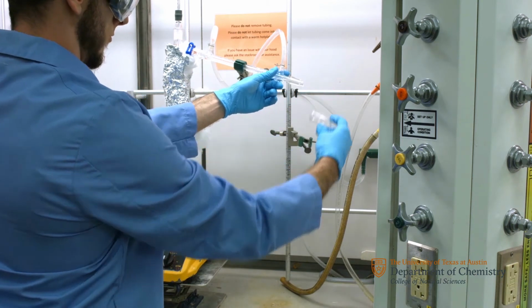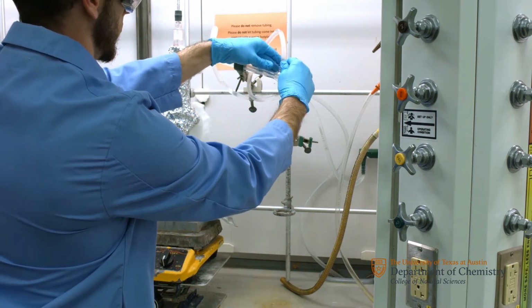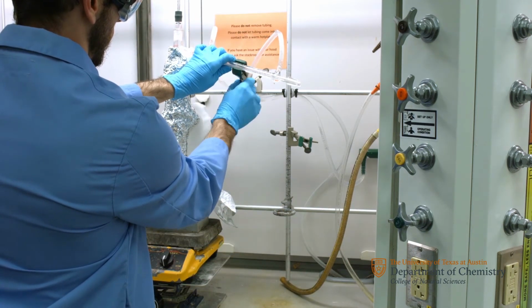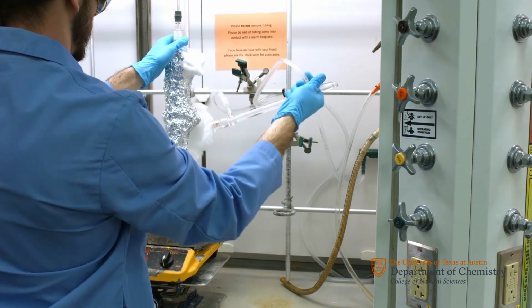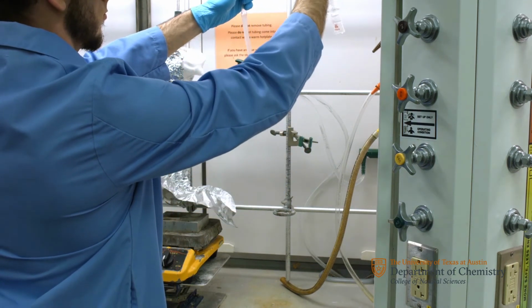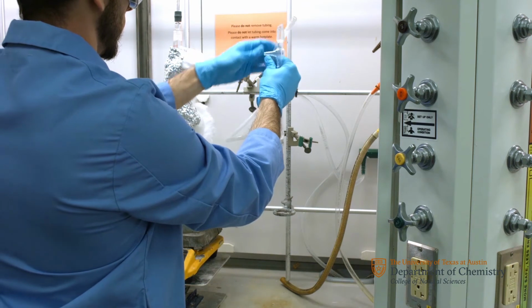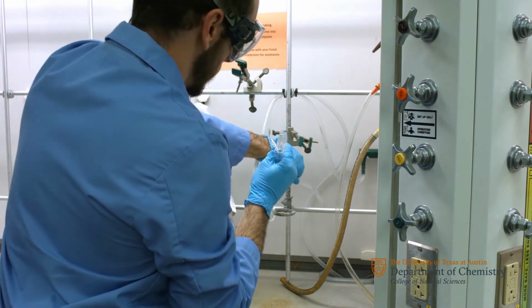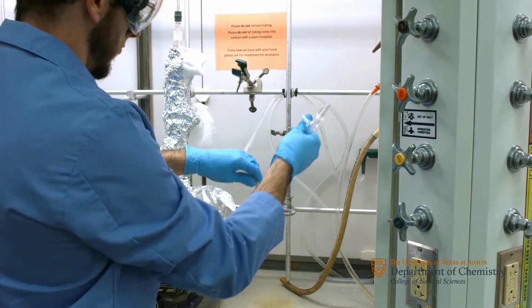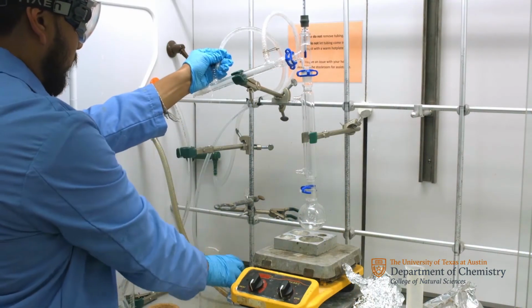First, remove the vacuum adapter. Next, remove the hose clamps and then carefully remove the condenser. Position it so that the outlet hose is on the bottom. Now carefully remove the inlet hose and hold the column up so that the water can drain. Next, hold the inlet tube over the hood drain so that it can drain. Alternatively, you can hold it over a large beaker, as shown here.